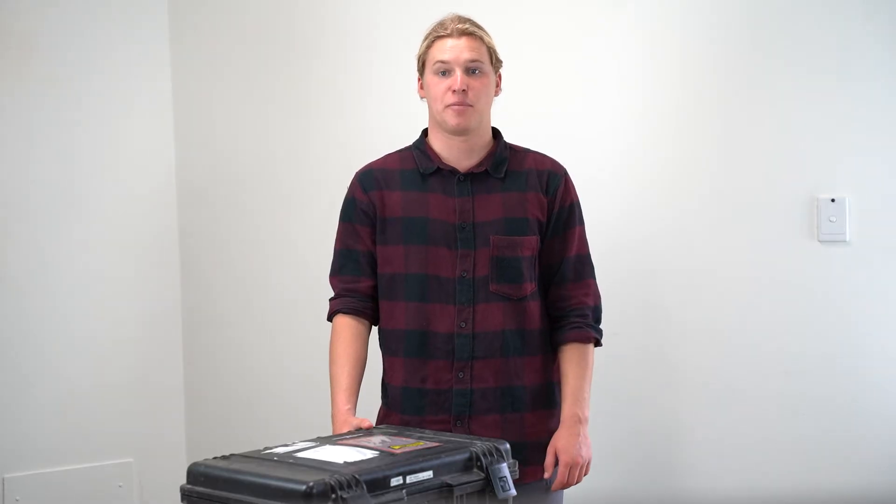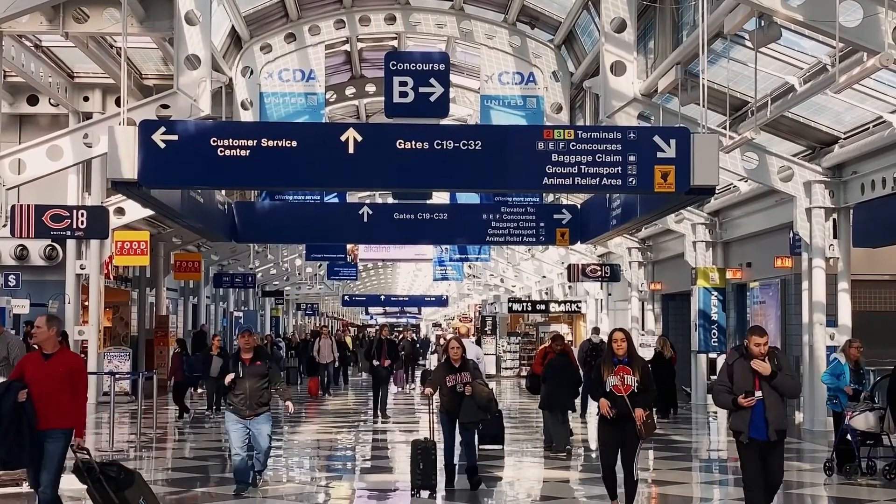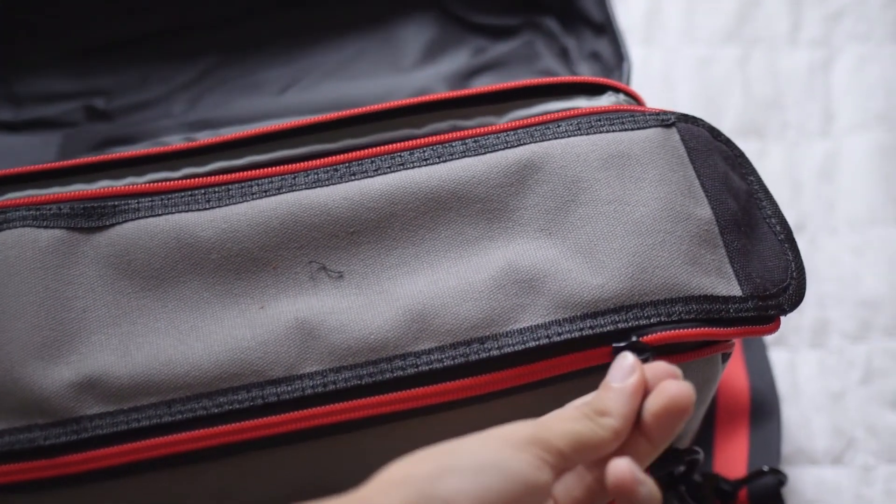And that's how to correctly pack up the NITON XL3T. One other thing to consider when packing up your XRF: if you're flying domestically within Australia, be sure to take out the lithium battery out of the case and put it in your carry-on as required.